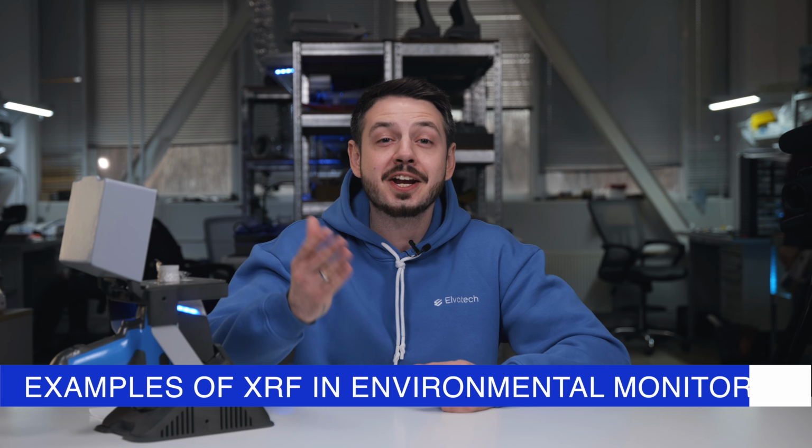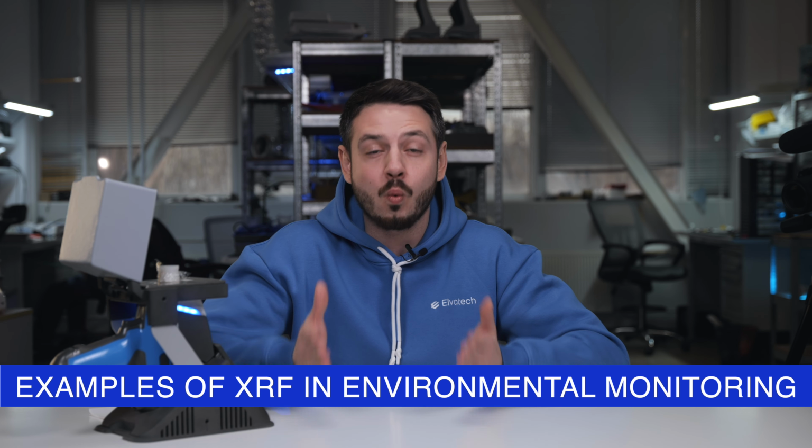And now, let's head on to our experiment. Today, we have a sample of a soil. And first of all, before we start our experiment, we need to cover up some things. When we work with the liquid or powder samples, it's always better to use a special cuvette to keep them here. And also, we need to make sure that we will have no impurities and everything is covered directly as needed. Because if there is any contamination to the device and for some reason you don't have the protective film here, it might get to your detector and your tube.